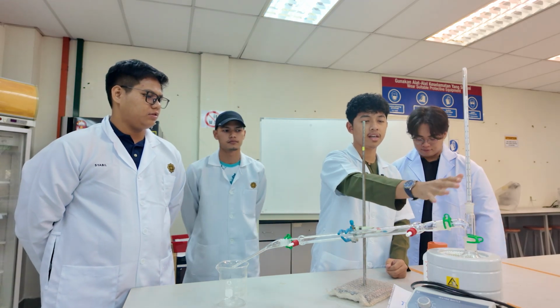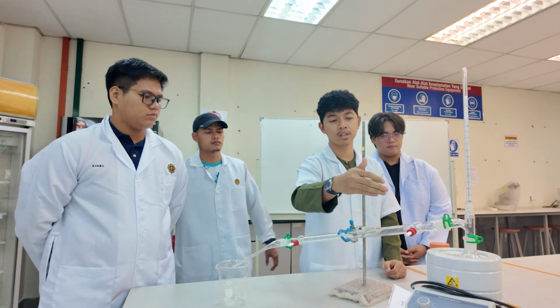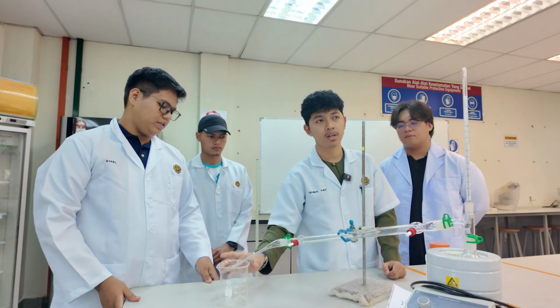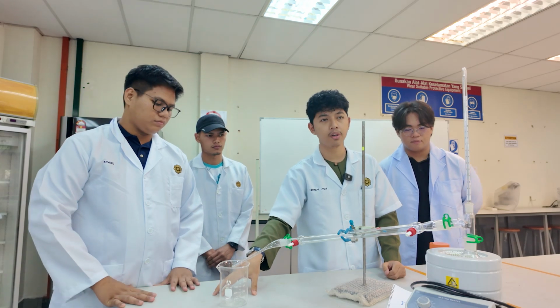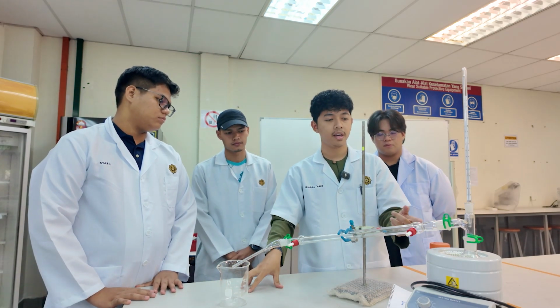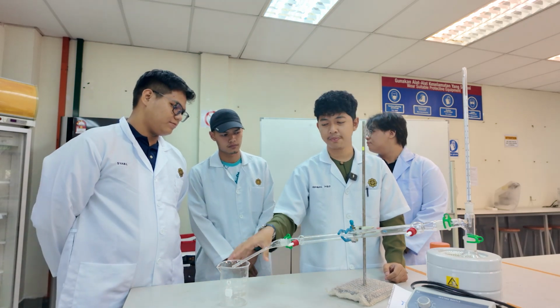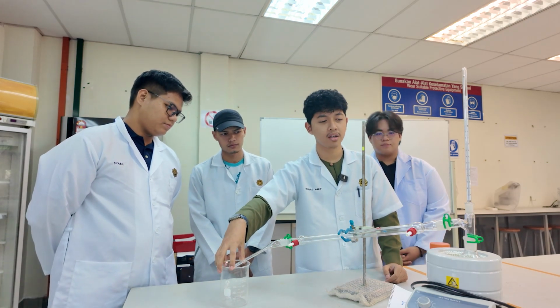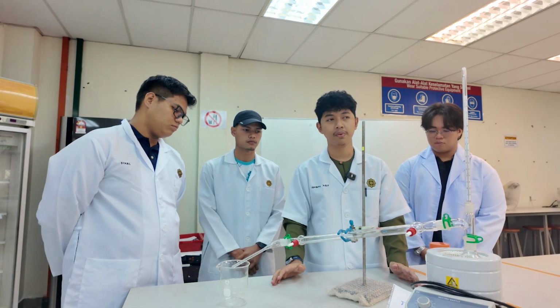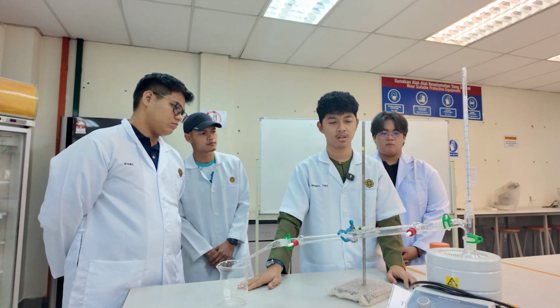After the gas condenses in the hollow section, it will condense into liquid, and then it will flow into our receiving flask. So the liquid with the lower boiling point will transform into vapor and then condense into liquid. So for our final product, we get to separate our two different liquids. So that's the distillation procedure.